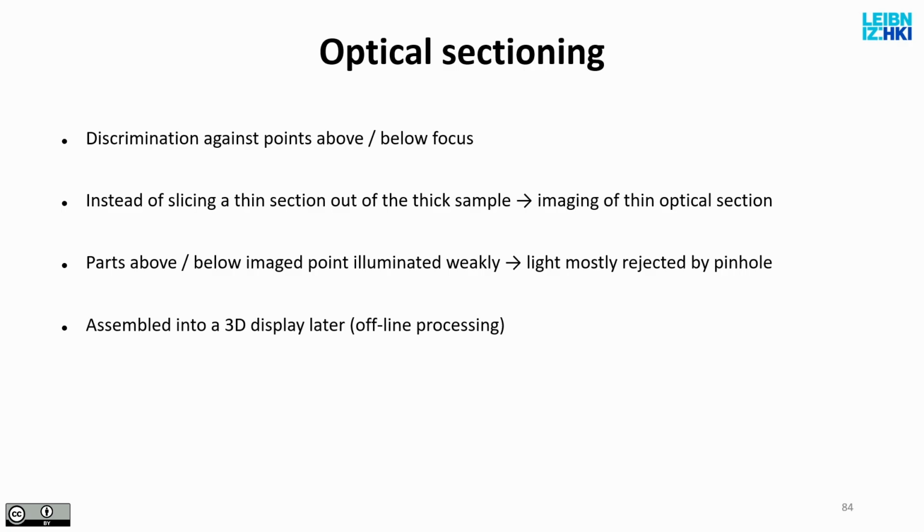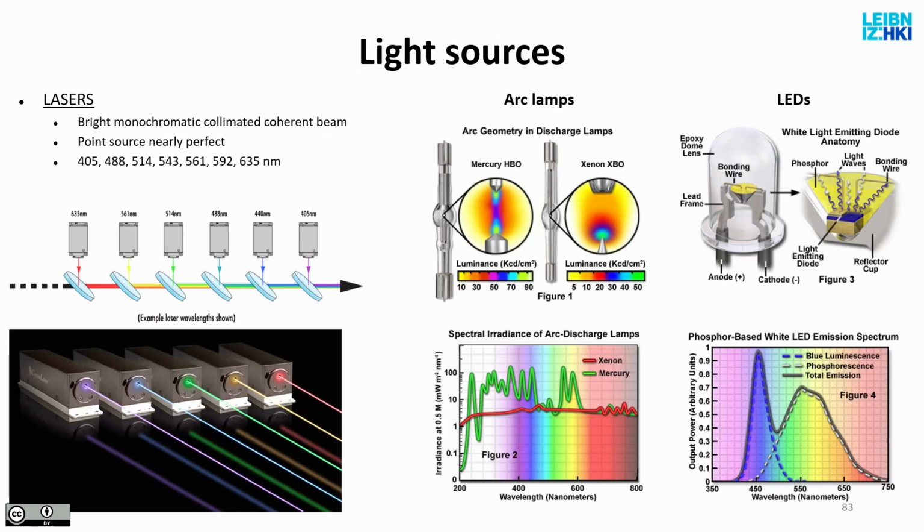Sorry, I'm just wondering, what's the difference between LED lamps and arc lamps? Is it only for the wavelength? The spectrum, yeah. So LEDs have these very nice Gaussian-looking spectra, and arc lamps have this ugly one. But mostly at LSM we have LEDs or?